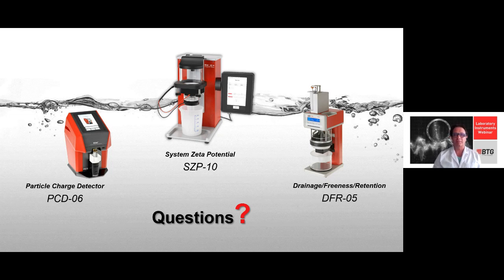So you can also use aggressive chemicals, namely, for example, sulfuric acid. You can go up to 70%. So fill it in the measuring cell, let it work a couple of minutes, and then you will get a perfectly white measuring cell back.